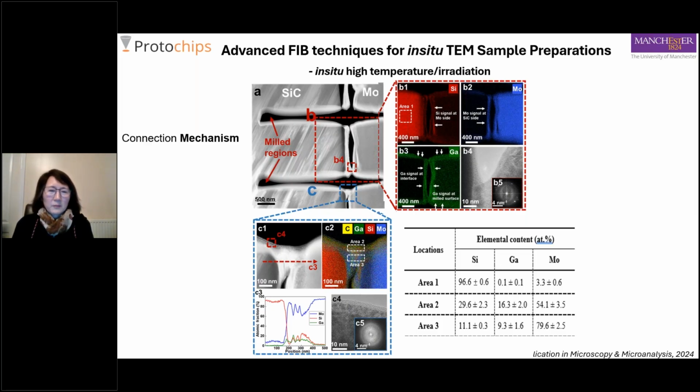To me, if some of you come across friction welding, this is quite similar to friction welding, although we don't have friction. This is ion beam redeposition. Like mechanical friction welding, you're not using conventional foreign materials to do the welding. It's just friction of two welding parts, which generates the same material that mixes in between and does the welding. This mechanism is quite similar to that. So we try to zoom in and see what exactly is the mechanism.